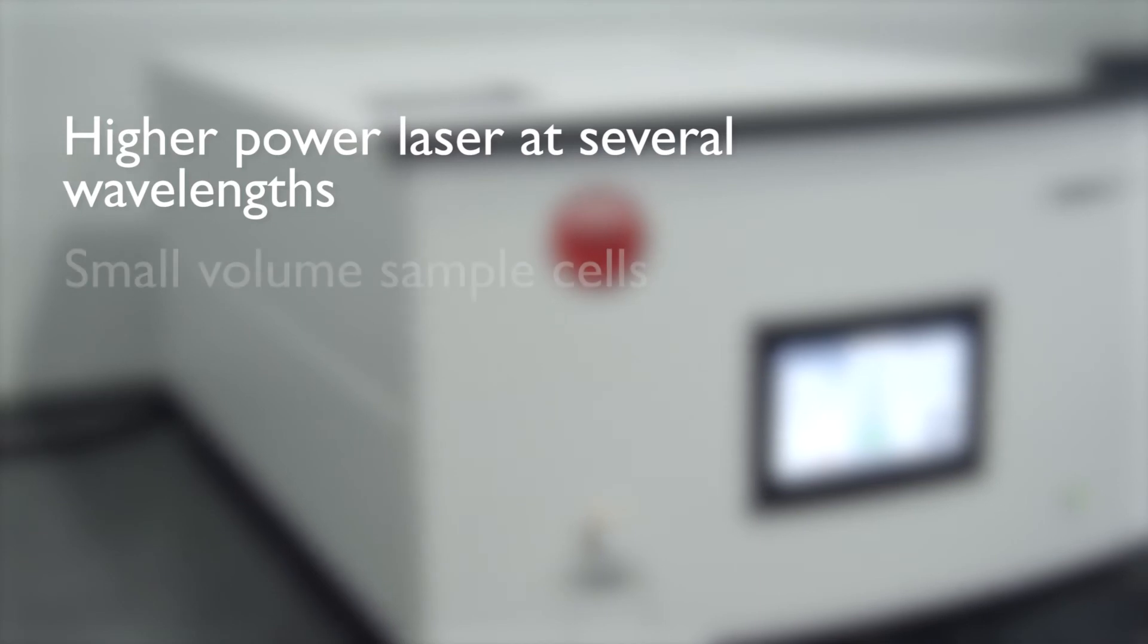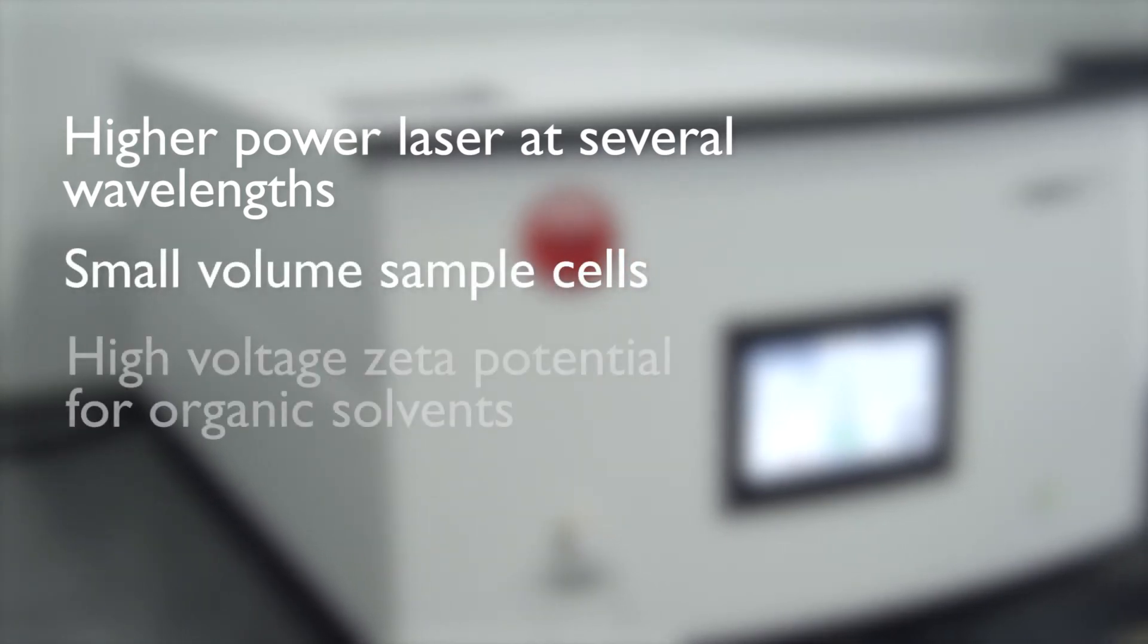Other options include higher power laser at several wavelengths, small volume sample cells, and high voltage zeta potential for organic solvents.